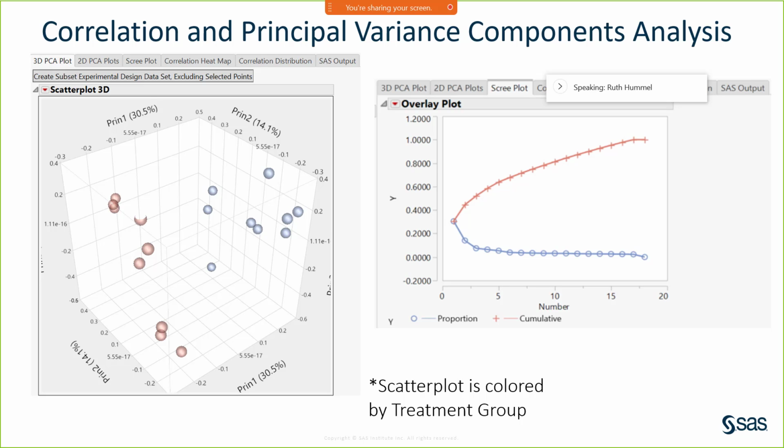I can also see the points are colored. Again, they're colored by treatment group, so I can see that whether you were treated with estrogen or not is making a difference on the variability in expression. So that's a nice confirmation for me that in fact there are differentially expressed genes to find. There's going to be something interesting here.